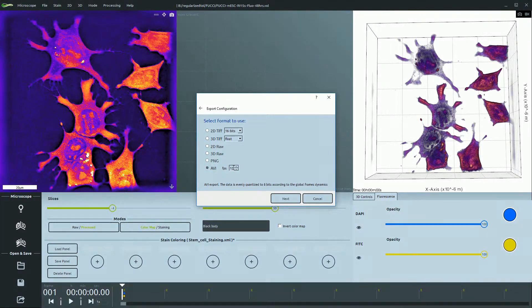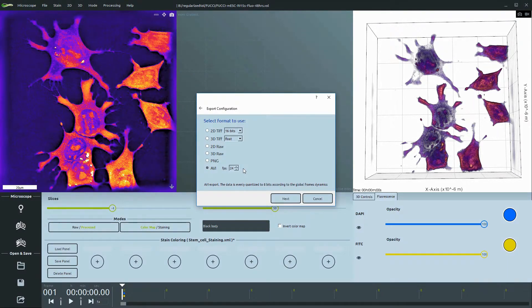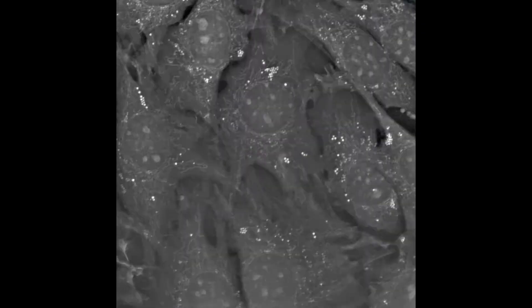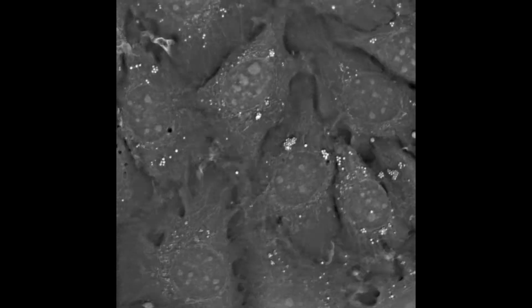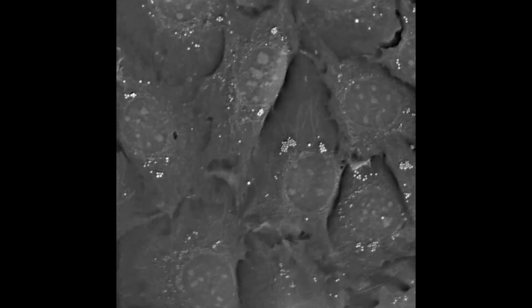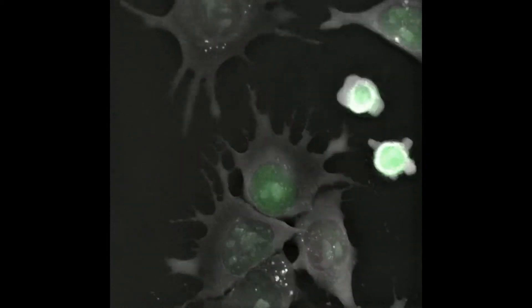You can set the frames per second based on the speed of the phenomena you're observing, but most commonly 12 or 24 FPS are used. AVI export is good for movies, but for image analysis it is highly recommended to export stacks in 3D TIFF.